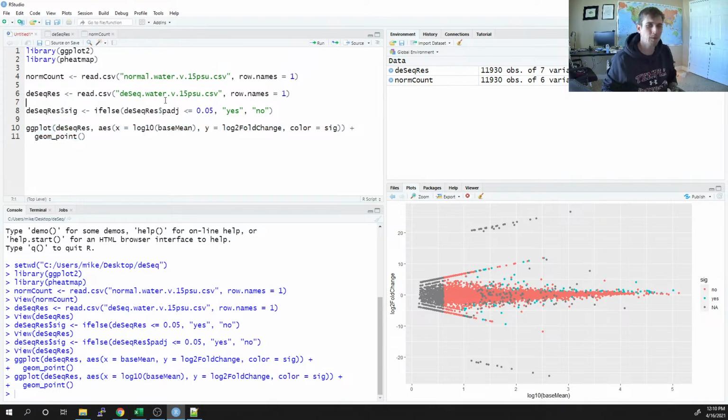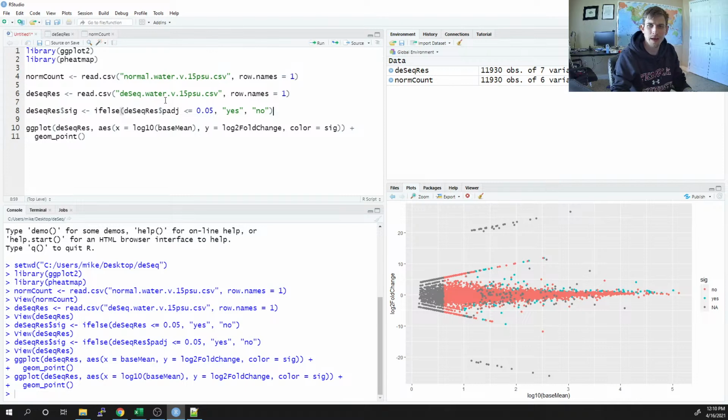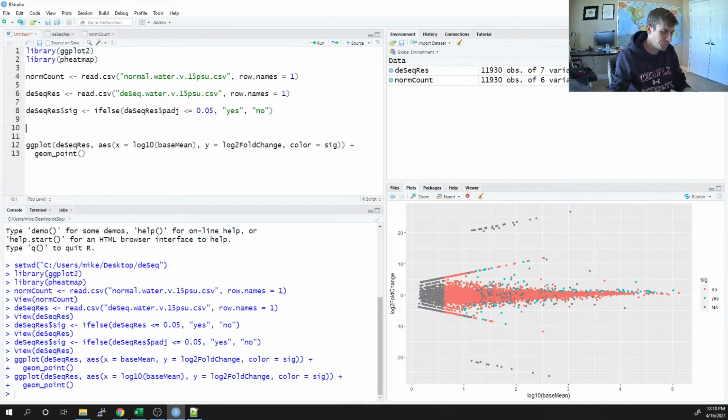So there is this weird property about DESeq that in some cases, if it really can't do a very good stats test, it's just going to populate p-value and p-adjusted with NAs, like not applicable. Basically means it really wasn't tested, or the parameters weren't met for it to be tested. Like there's a serious outlier or something along those lines. So there's something I forgot to do, and that's to remove the outliers. And so I can remove the NA omits. I can remove the NAs. That's what I can do, and that's really not that bad to do.